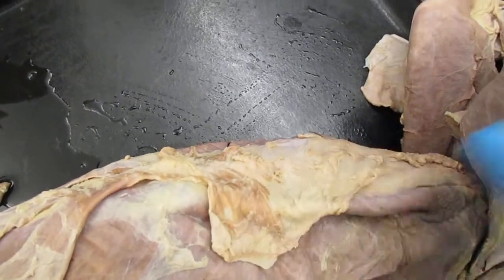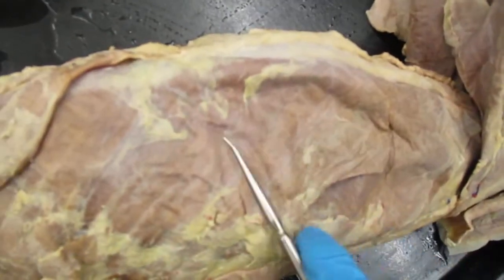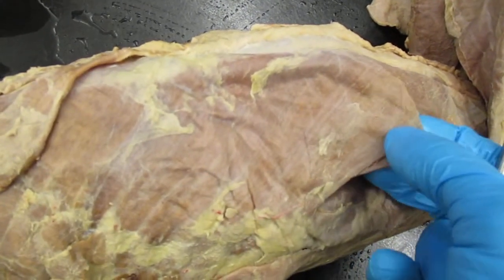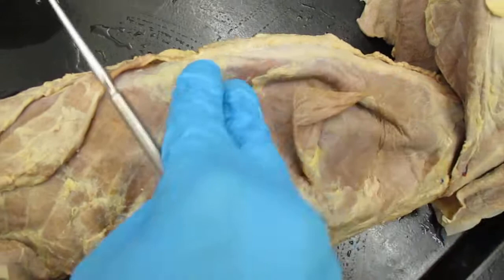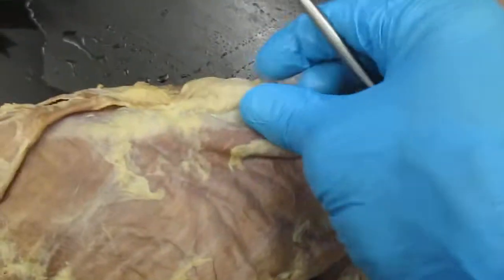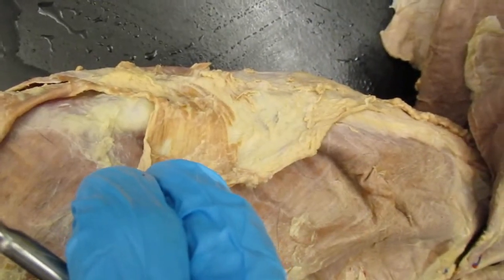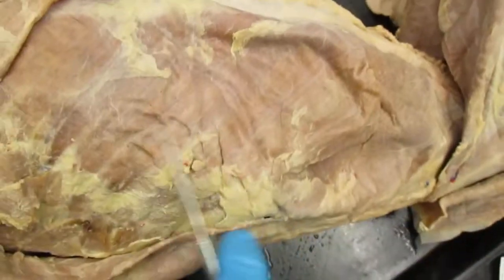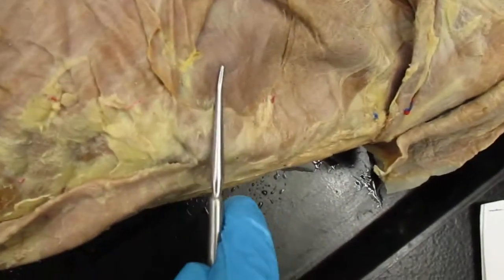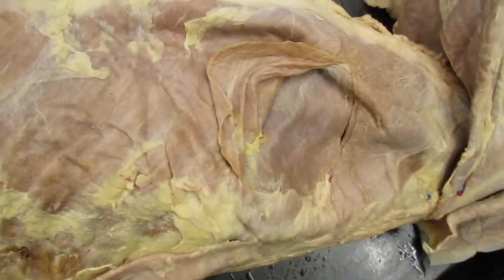External oblique right there. Now, internal oblique is all this stuff that you see right here. Internal oblique. Now, let me reflect this back here, and you'll see the transversalis or transverse abdominis. So let me go through that again. So what is this? This is your external oblique. Internal oblique is all this stuff right here. And then you can see the transversalis right there. So hopefully that makes sense.